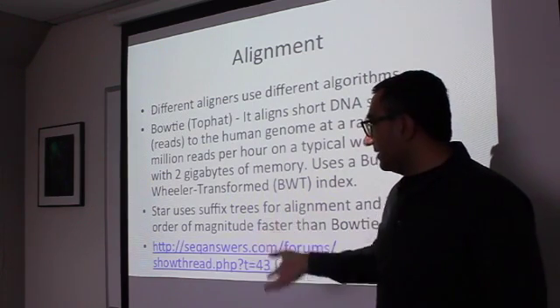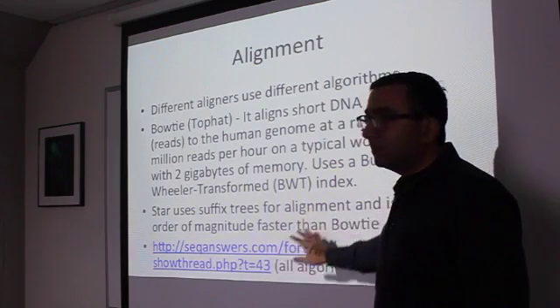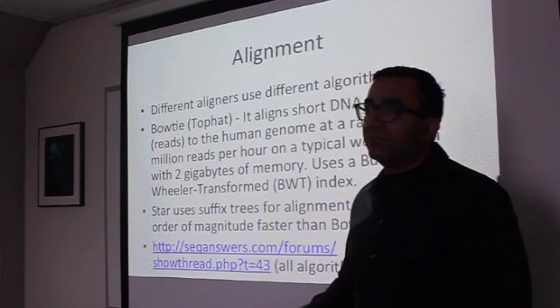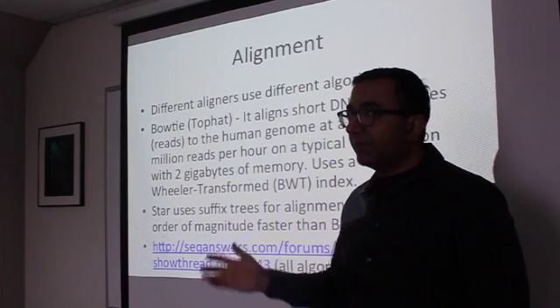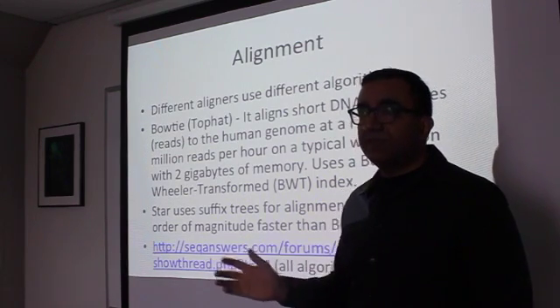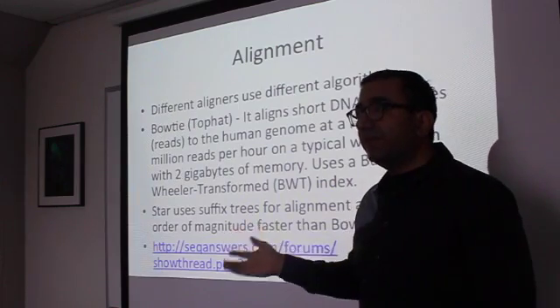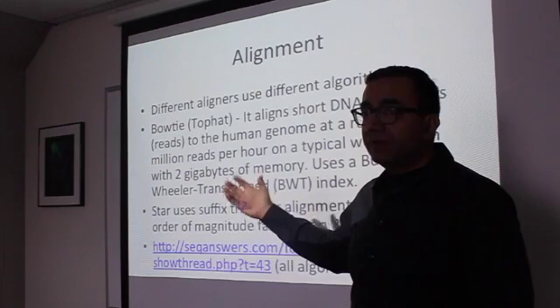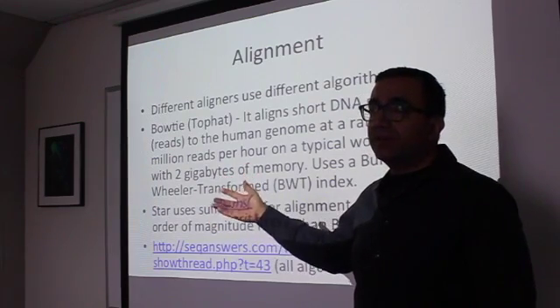So for RNA-seq, I can officially say that yes, STAR works better than Tophat. But for ChIP-seq, I haven't really compared across the breadth. I don't do so many ChIP-seq. But if I was to use it, I would still just start with STAR, and then go and search the literature and see which other aligners are there.